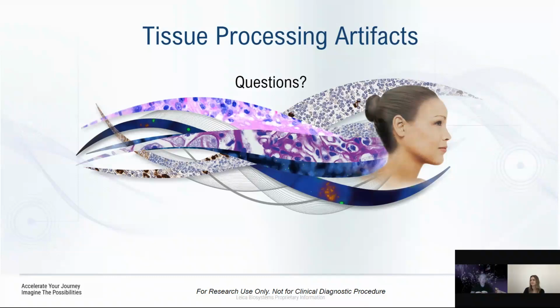From what I recall, I would see specimens come in a lot in Michel's if it was for skin studies, right, to look for immunoglobulins, especially in inflammatory diseases. So my go-to for just routine histology has always been NBF.